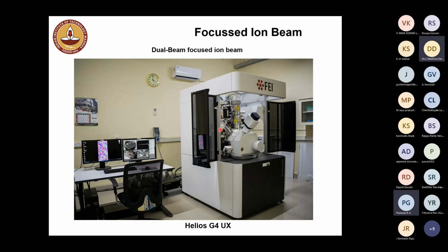And also, if you want to do thin films, semiconductors, insulators, ceramics, etc., then electropolishing is no longer possible. And this is the only method by which you will be able to produce samples for atom probe tomography.